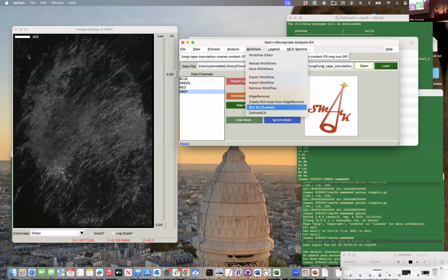And this is a good idea to get the community to think about how they want to process data and come up with standard ideas that are shareable. We all want to do the same thing to a lot of our data sets in a very repeatable way, so having the ability to share a process is nice. It's not quite as fancy as Orange, if you're familiar with it, where you can make little graphical models and draw them all together, but it is a little list. So I want to do these steps. It follows through.